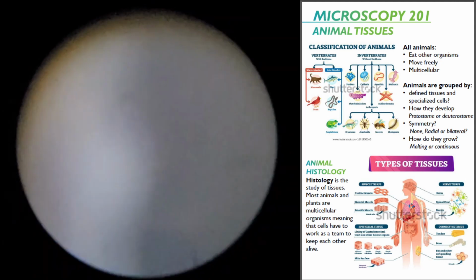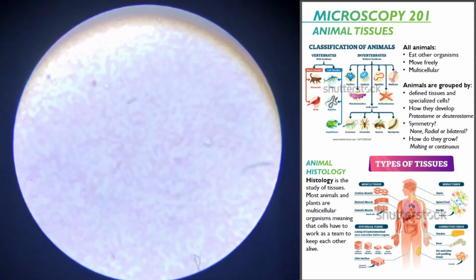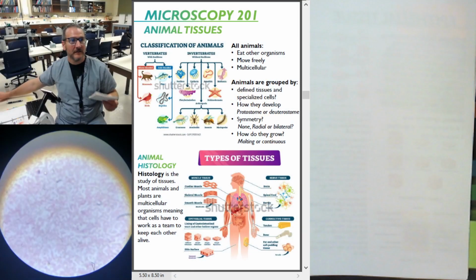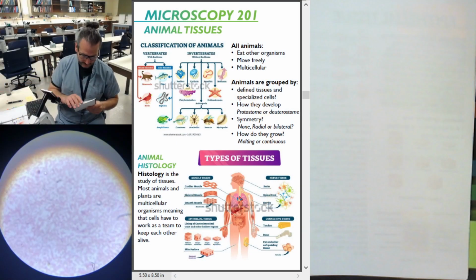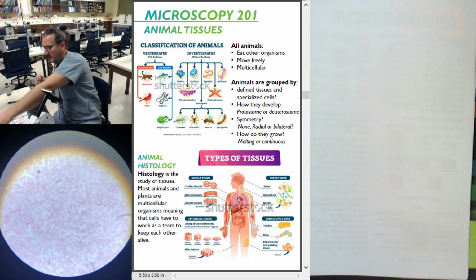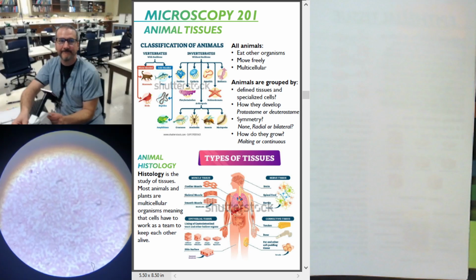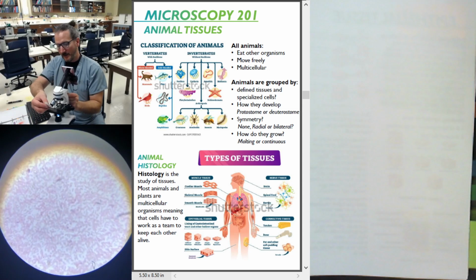I'm going to use a piece of lens paper. So we just happen to have in the lab a big sheet of lens paper. I don't need a full sheet, I just need the edge. Someone had ripped the rest of the page off. I can use that. I'm going to come down. And this is my 40x.